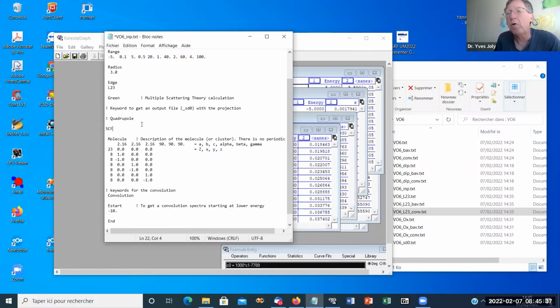So it's a more complex case. And to tell the truth, I prefer not to consider it and do it in a self-consistent way, if all the atoms inside are considered, rather than charging the atoms. Most often it's the best. But nevertheless, it's possible to charge the material.